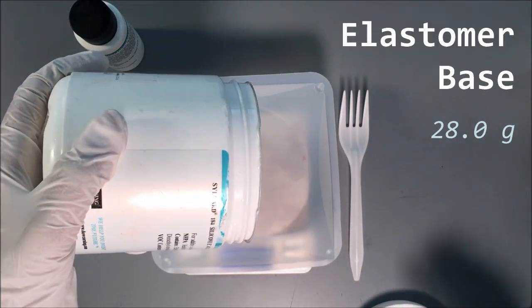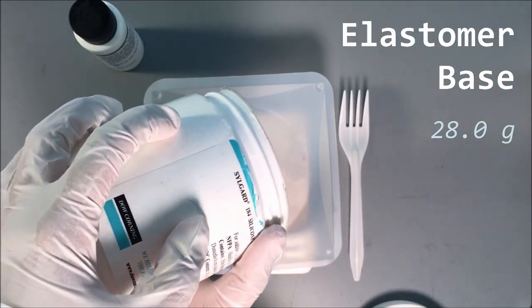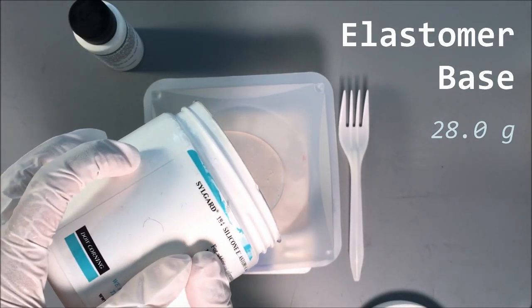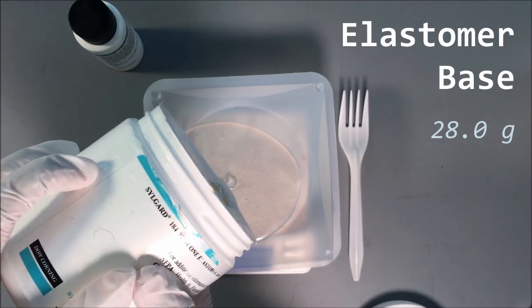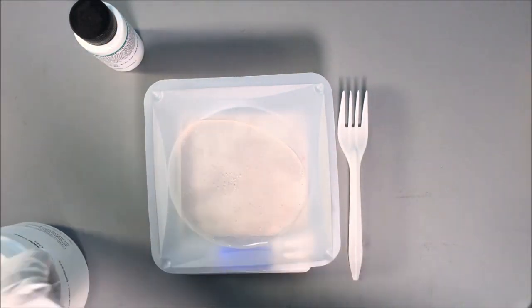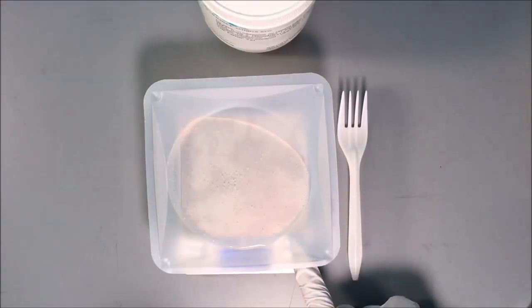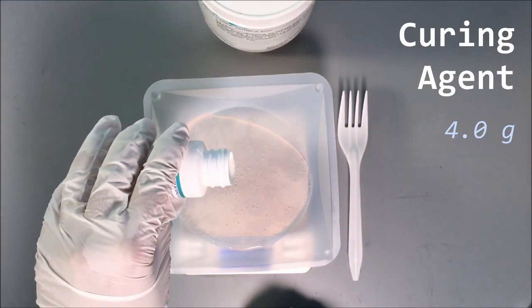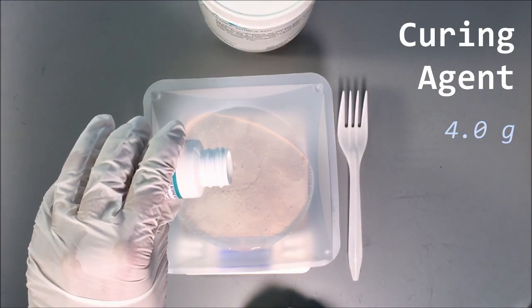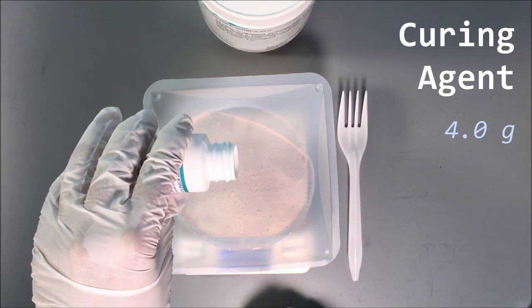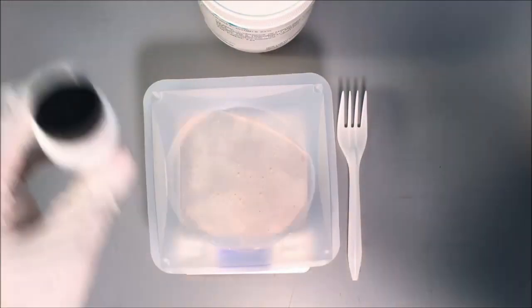Begin by pouring 28 grams of elastomer base into the plastic weighing tray, followed by 4 grams of curing agent. If you would like to adjust the thickness or size of PDMS made, refer to the linked PDF for further instructions.